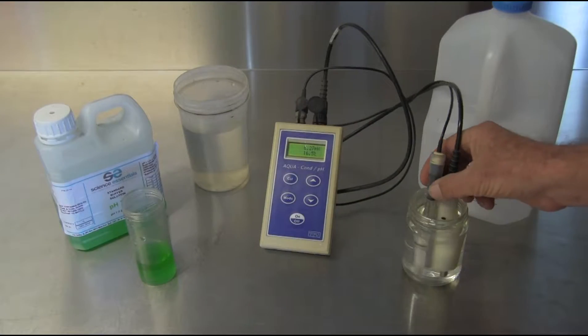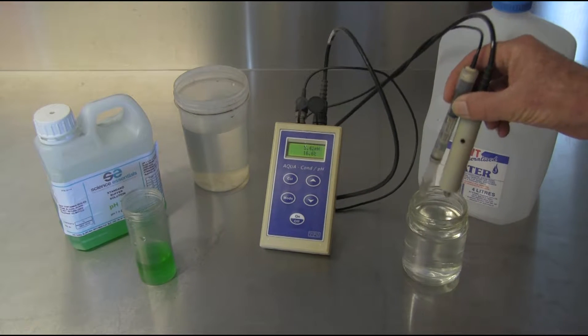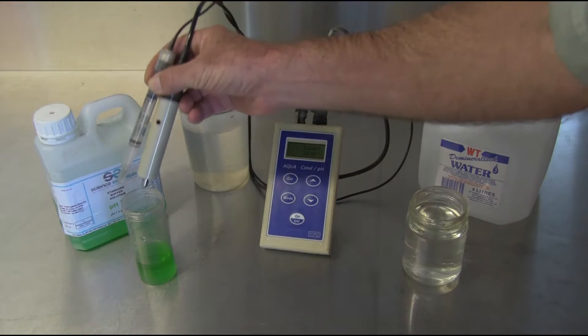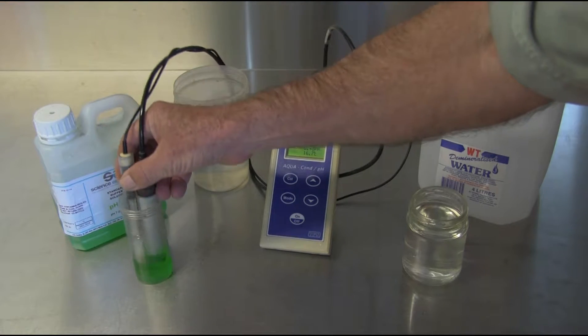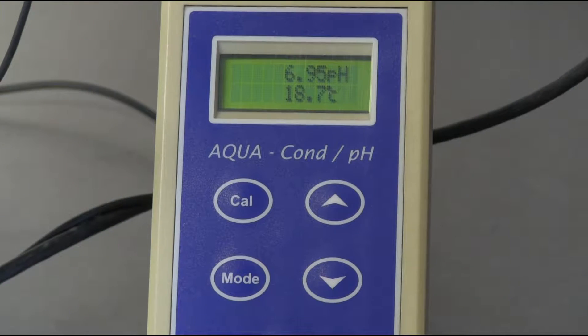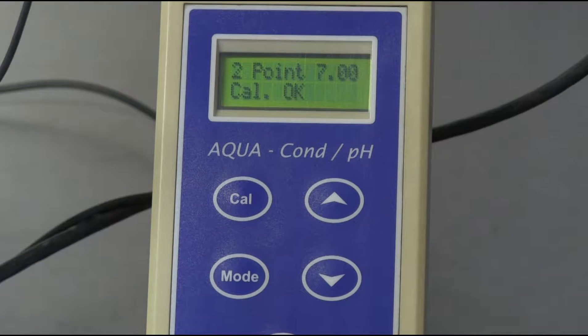If only a one-point calibration is performed, a buffer should be selected about midway within the range of readings likely to be encountered during testing. For additional accuracy, some meters have the capacity to complete a three-point calibration. Most modern meters have the capacity to recognize the value of the buffer or standard being used and to automatically calibrate to each solution, simplifying the calibration process.